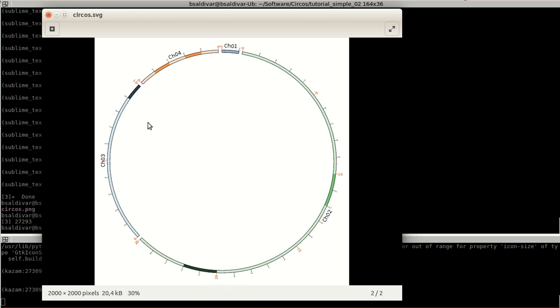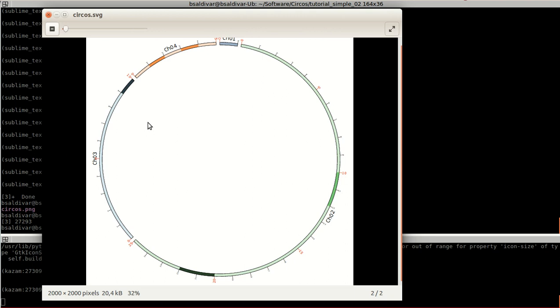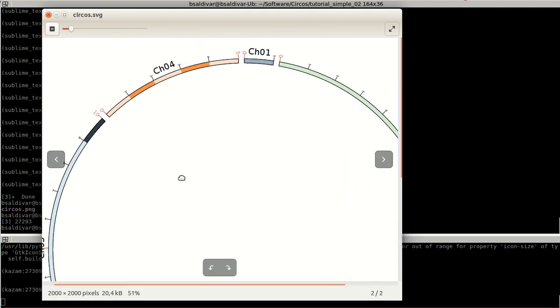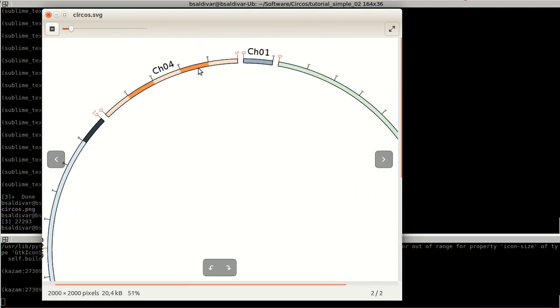Hello, here in this tutorial I will show you how to create bands. Here the bands are these spaces where the color is more intense.